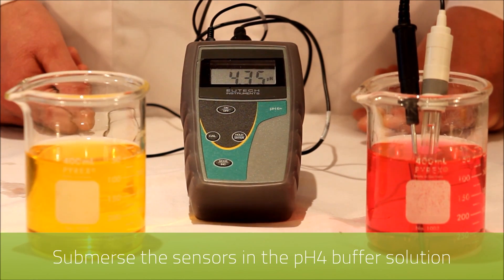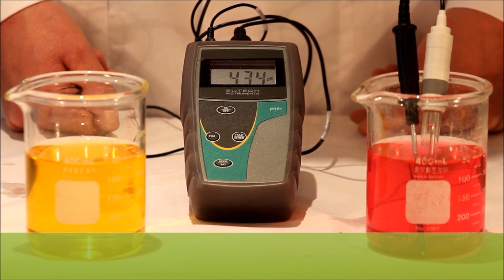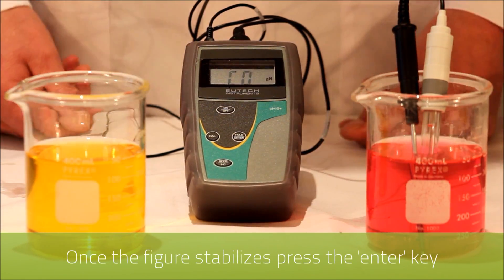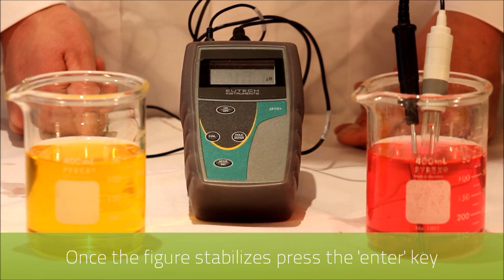Again you'll see that the reading has dropped. When this stabilizes we again press the enter key. As you can see the reading has been adjusted to the correct reading.